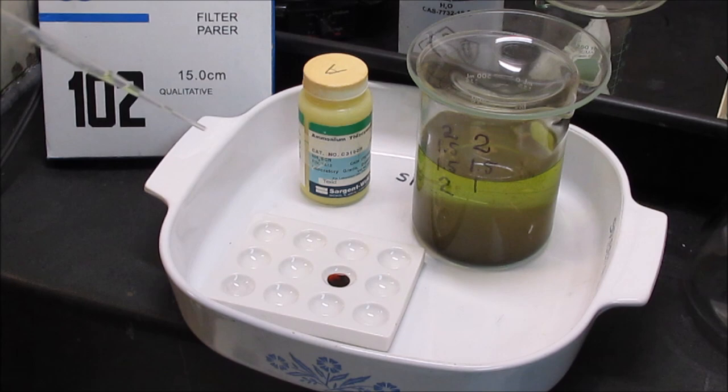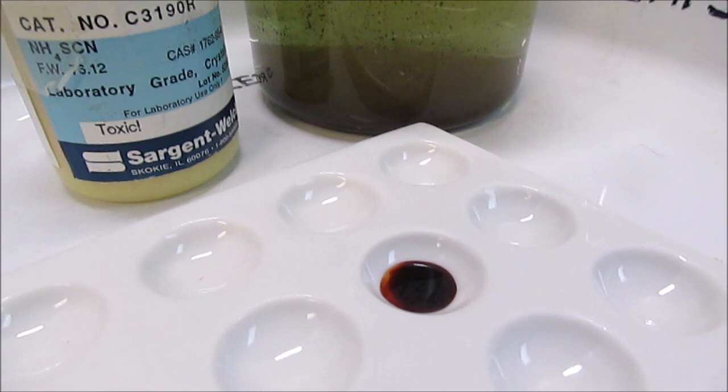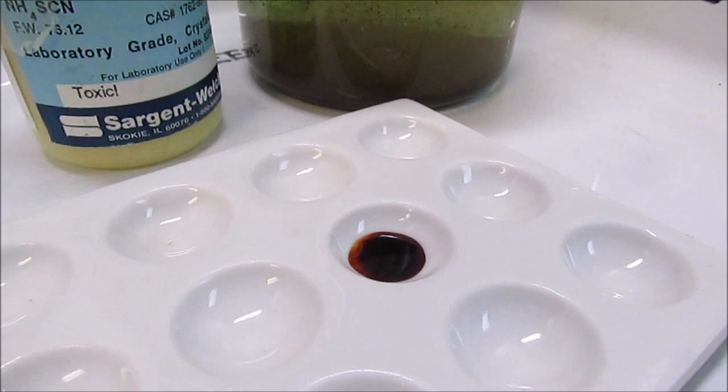So it looked like there was still some precious metals in solution there. And I did a stannous test. It was negative. I put some of the solution down in the spot plate with some ammonium thiocyanate. It turned blood red. That confirms I've got iron in solution. So that's what's giving that solution that color. It's iron.